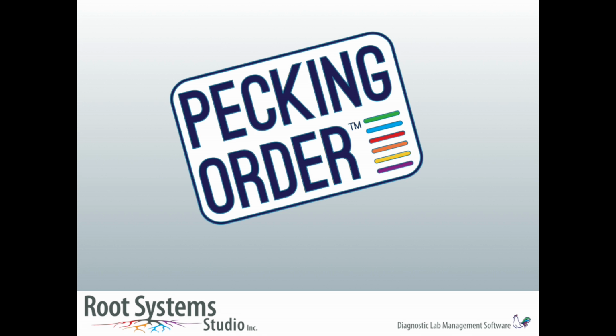That's a basic introduction to the structure of Pecking Order. For a more detailed discussion about how it can help manage your workflow, please join us for a live demo.